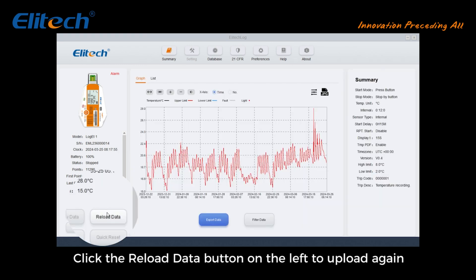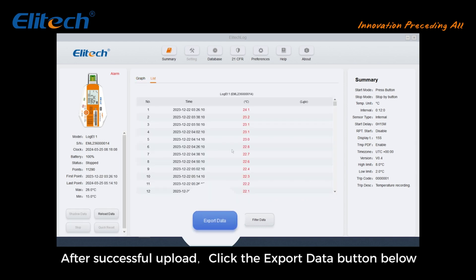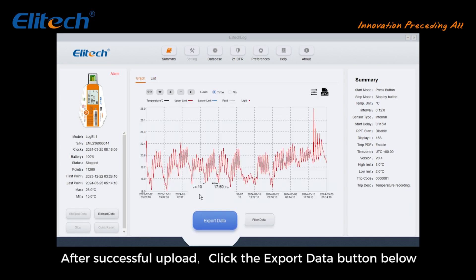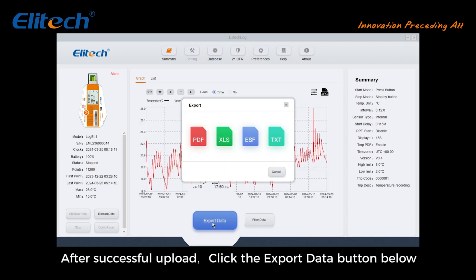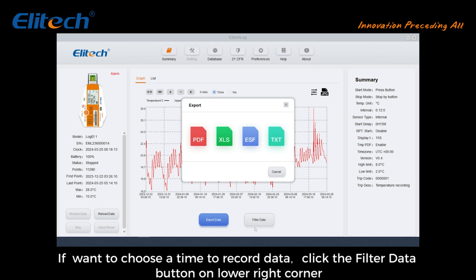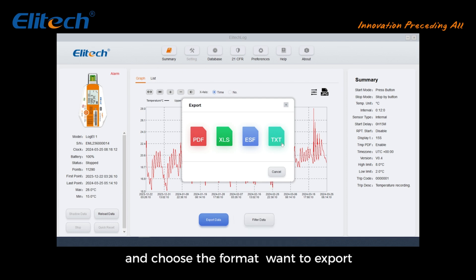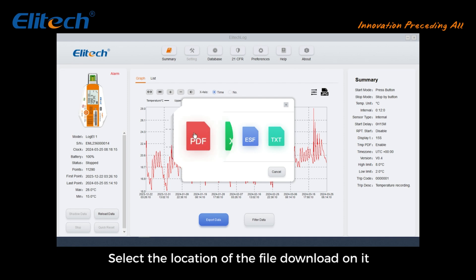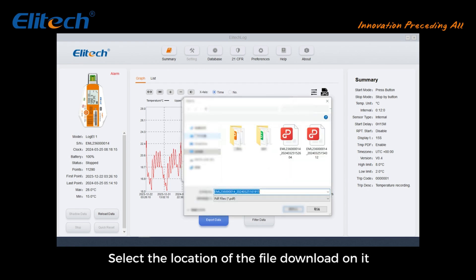After successful upload, click the export data button below. If you want to choose a time range to record data, click the filter data button in the lower right corner and choose the format you want to export. Select the location of the file download and confirm.